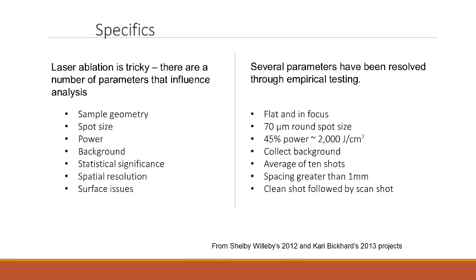At the heart of the LIBS is laser ablation. That is, exciting a small amount of the sample using a high-powered laser. That has its own problems, because the laser actually has to interact with the mineral lattice. We've found through testing that there are several parameters that help to produce clean, good-looking analyses time and time again. However, we continually find that we need to make adaptations depending on individual mineral specimens.